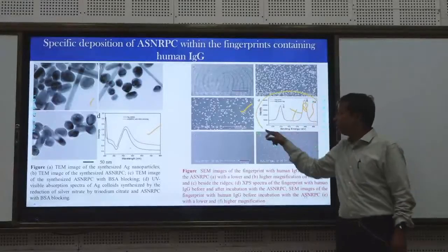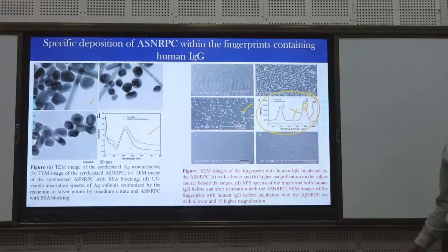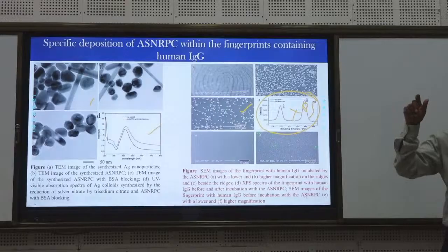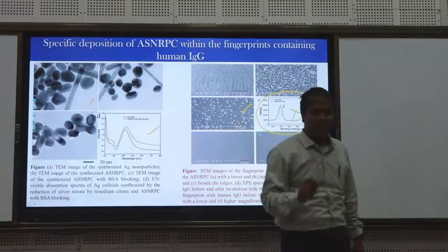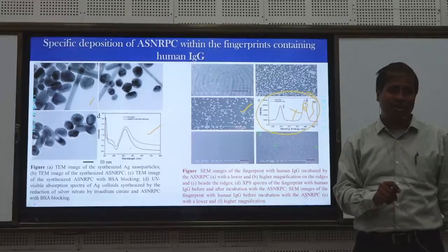And this is purely spectroscopy, XPS, photoelectron spectroscopy. It talks about these electrons in 2p, whether it is a 2p electron or 3s electron, that kind of talking. Biologists have no idea. So the underlying importance is that if you want to really find out some good information, you have to make collaboration.